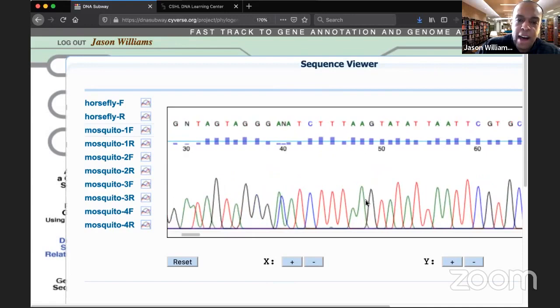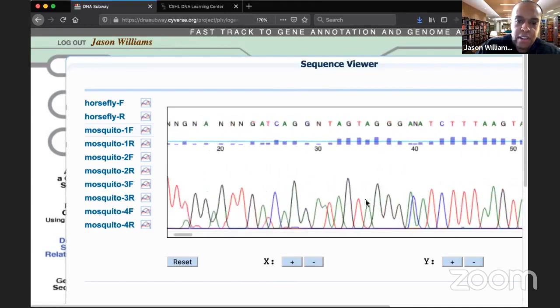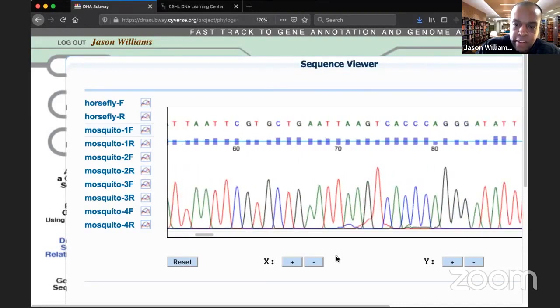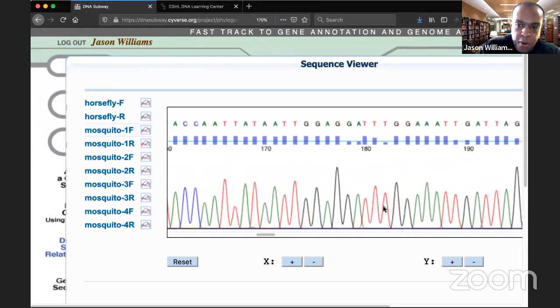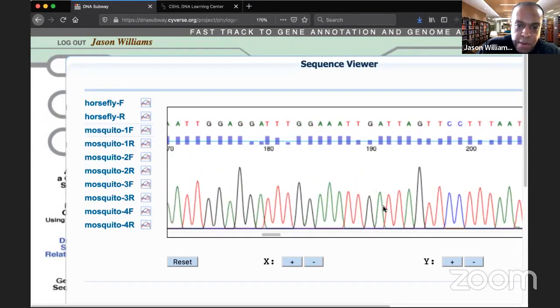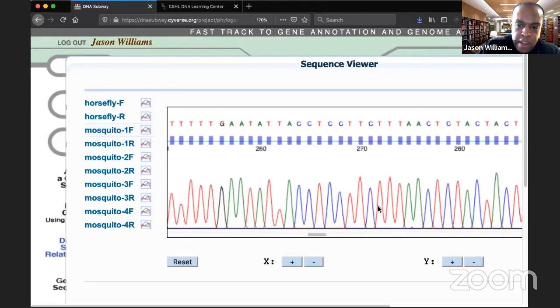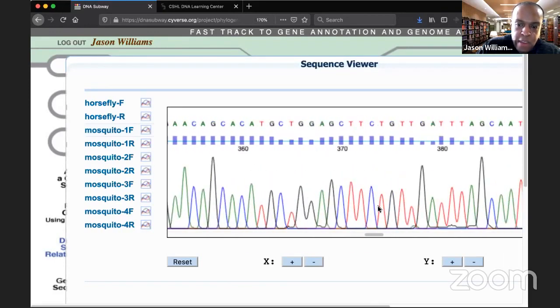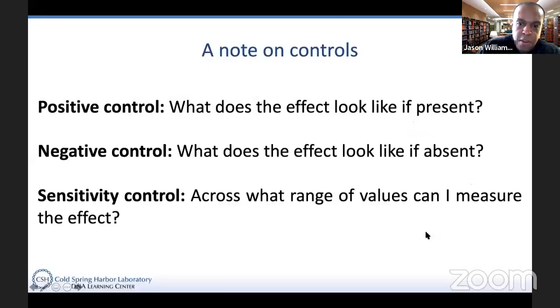So when you have a very good signal and a strong signal, you get the ability to measure this DNA really nicely. But when that signal degrades, even here when it apparently looks pretty good, but 70, 80, there's a little bit of background noise. And if I go around, often you can see places where there might be signals that are a little bit too close together, or sometimes where you might get a drop of a little bit of background noise. So that's the question that we're interested in. Okay, if I go back to my slides, those are questions that you might think.